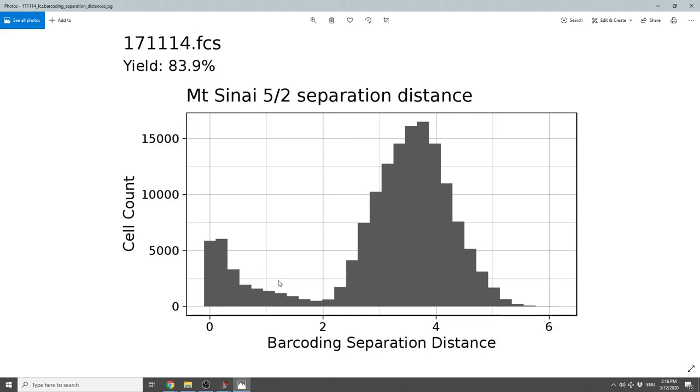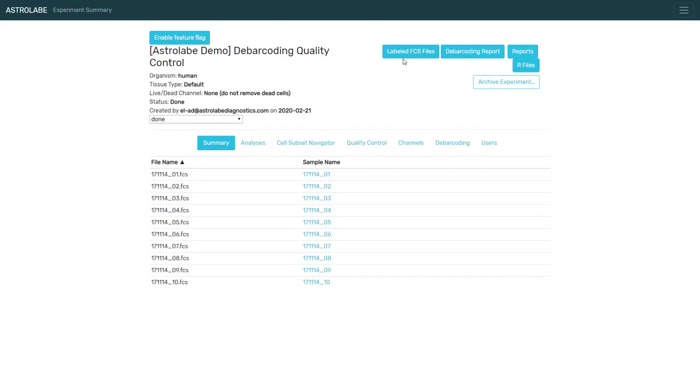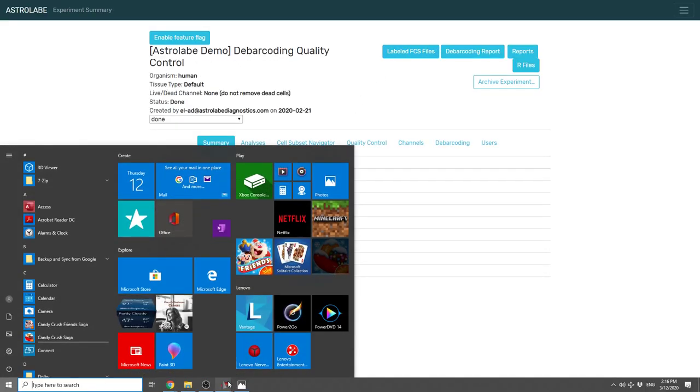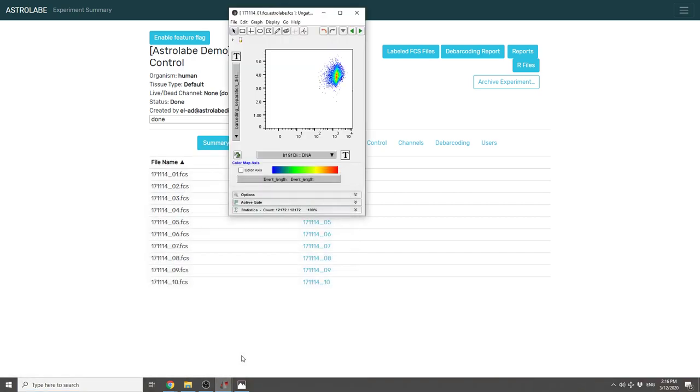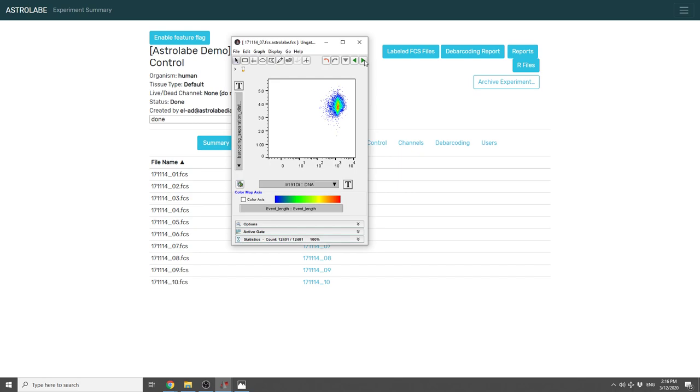One last thing that Astrolabe lets you do is you can download the exported FCS files from the platform. They are going to include an additional channel for the barcoding separation distance. So you can take the separation distance and put it against time in each one of your samples and make sure that it looks as clean as you would expect it to see.